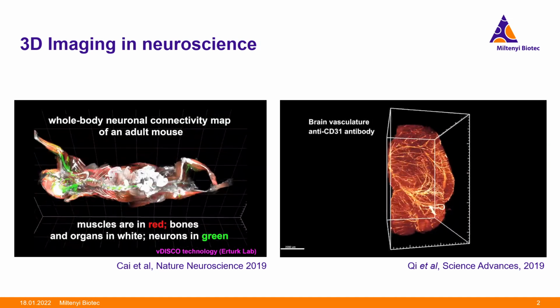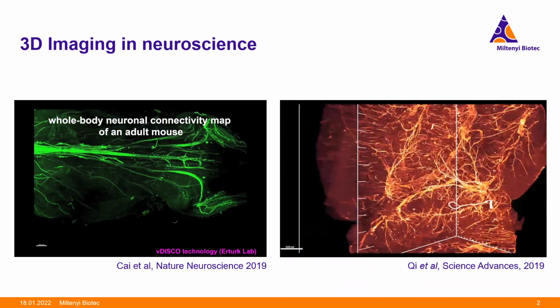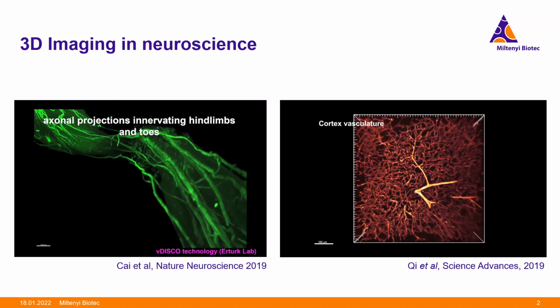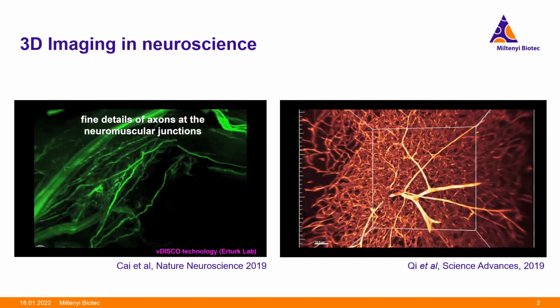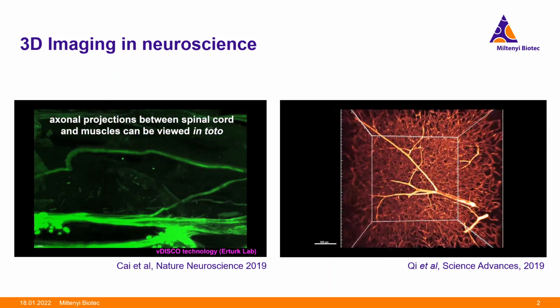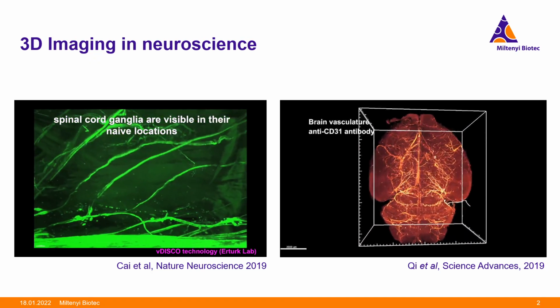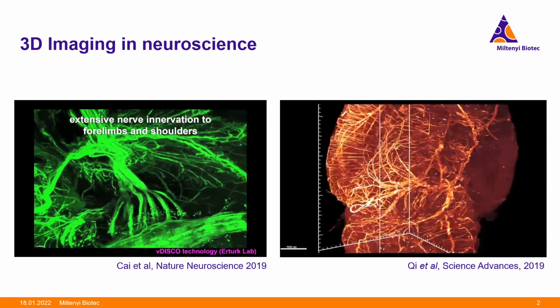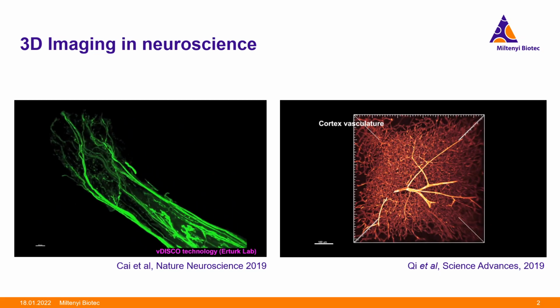There is no mistaking that understanding the 3D environment in biology has become an important aspect for many scientific questions. For example, in neuroscience, the disciplines of brain imaging, nervous system imaging, and neuron activity analysis have benefited from 3D microscopy imaging tools and markers. In the past, these applications would need to be sectioned to be imaged, thus losing the 3D spatial information. However, with volumetric imaging techniques, this research can now obtain detailed structural mapping and connectivity tracing.